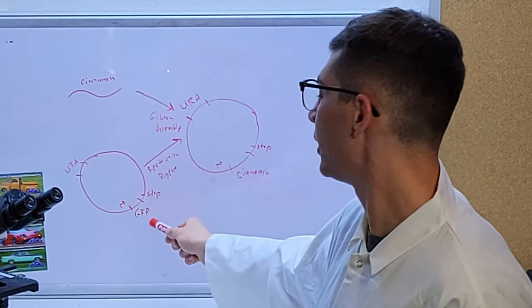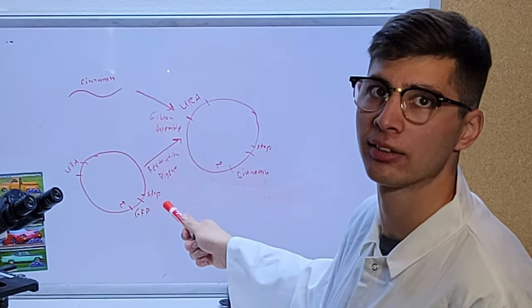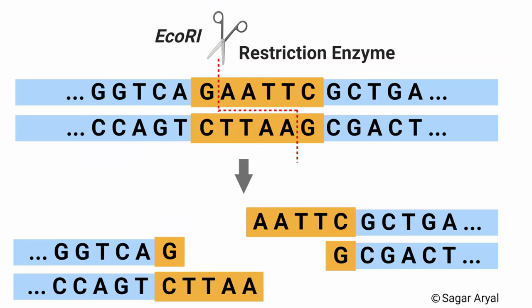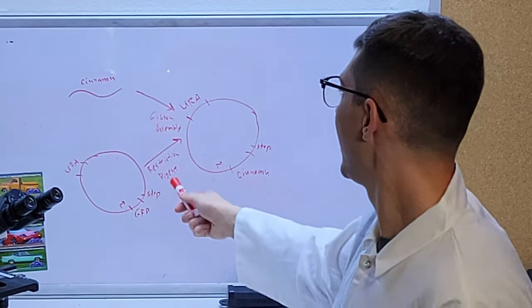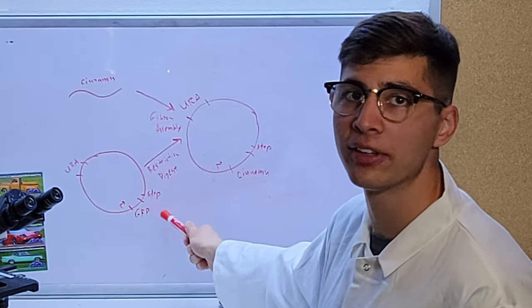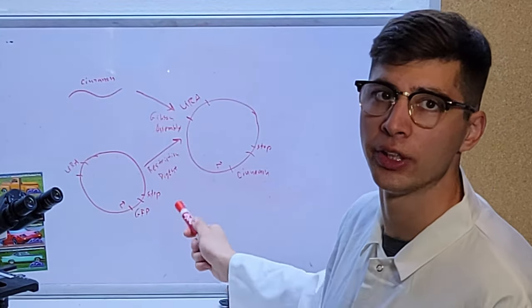First, let's get rid of our GFP gene. The easiest way to do this is to do a restriction digest. There are short sequences, usually about six base pairs long, of palindromic repeats — they're the same one way as they are the other way. Particular restriction enzymes will cut in a different way at these different restriction sites. This plasmid was designed to have restriction sites around the gene so that you can easily cut out an old gene and put a new one in. So restriction digest is how we get rid of this GFP gene.